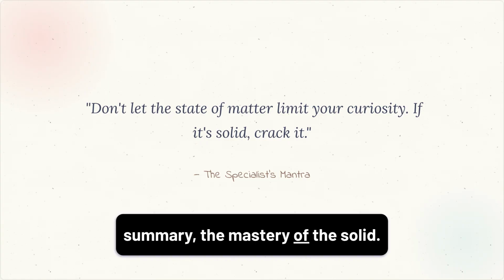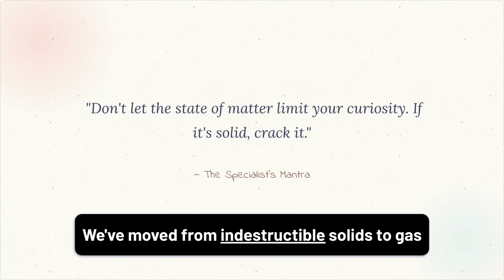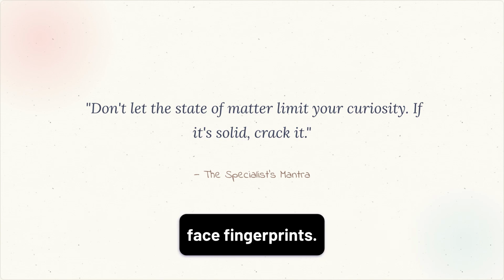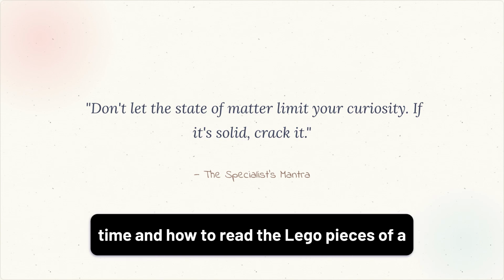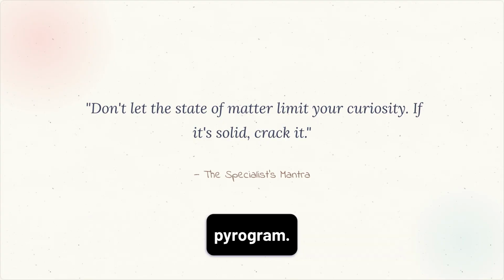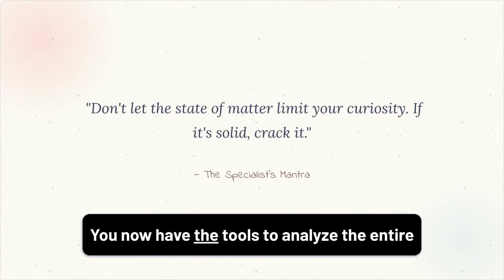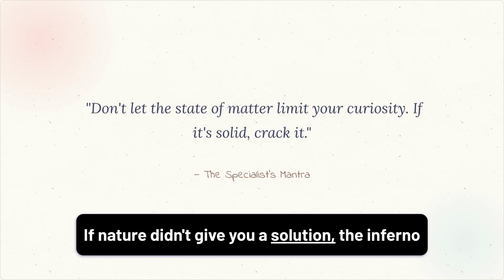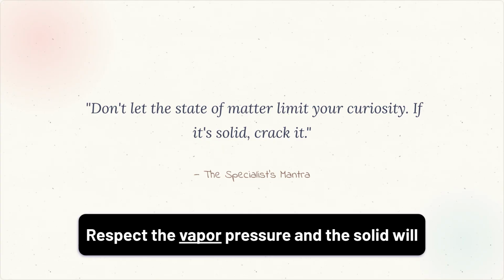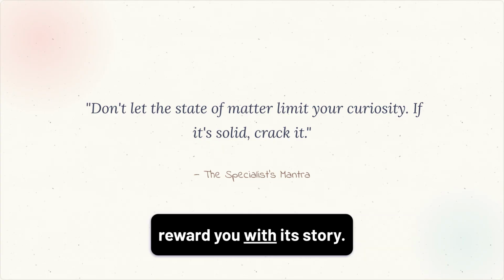Summary: the mastery of the solid. We've moved from indestructible solids to gas phase fingerprints. You now understand the difference between cracking and burning, the importance of rise time, and how to read the Lego pieces of a pyrogram. Don't be limited by liquids. You now have the tools to analyze the entire material world. If nature didn't give you a solution, the inferno will. Respect the vapor pressure, and the solid will reward you with its story.